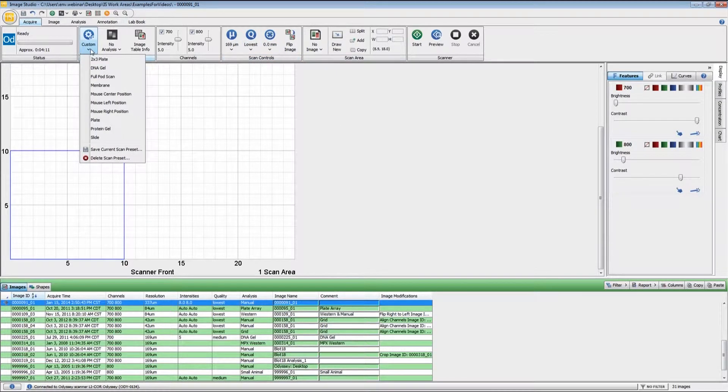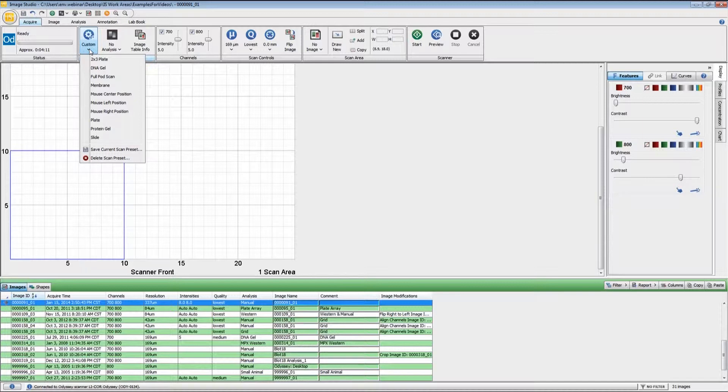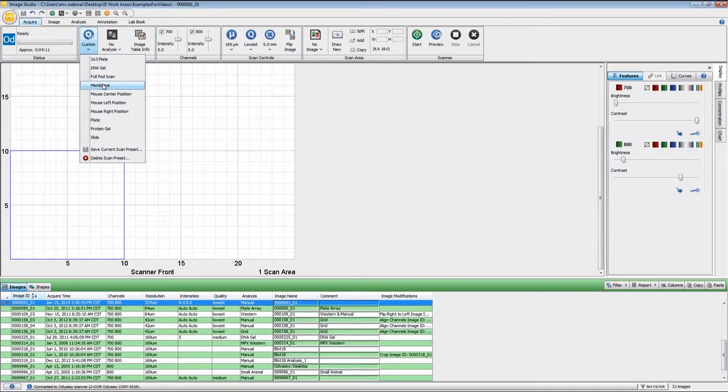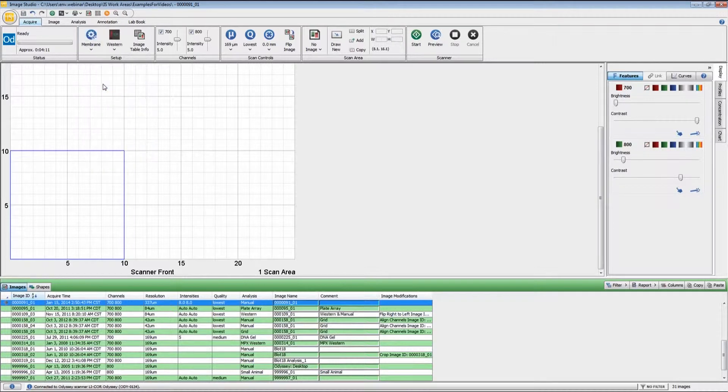There are a series of presets that you can use, ranging from gel-based assays, small animal imaging, membrane type applications, plate-based assays like the Incel Western, and slides. I'm going to set this for membrane because I'm going to be doing a Western blot scan.